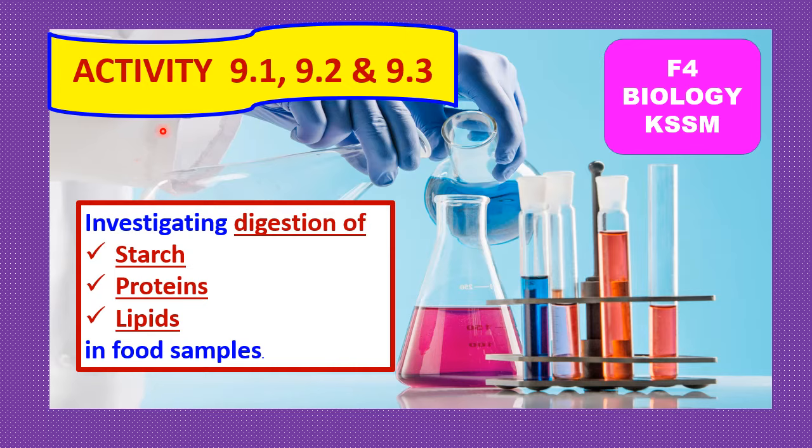In this short video, we'll be discussing activity 9.1, 9.2 and 9.3 in the Form 4 Biology KSSM syllabus. And these activities are to investigate the digestion of starch, proteins and lipids in food samples by enzymes. So let's get started.